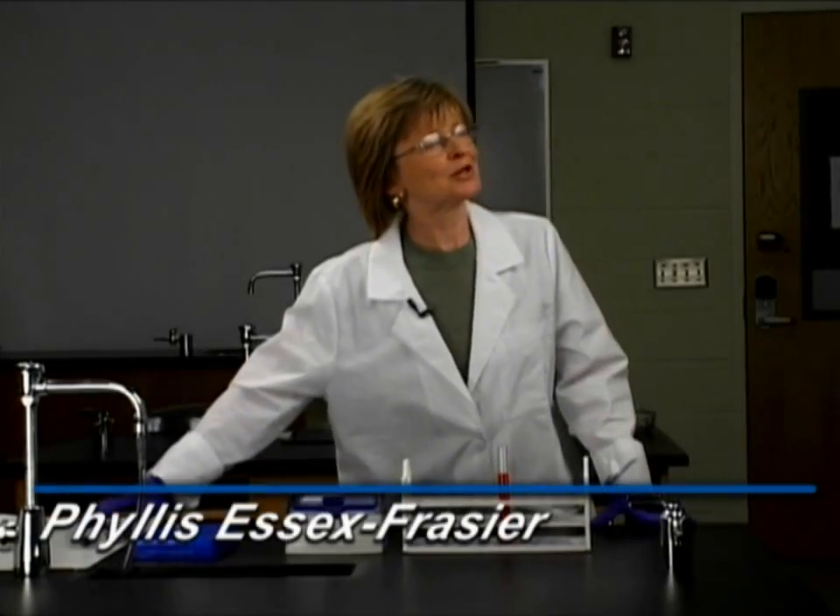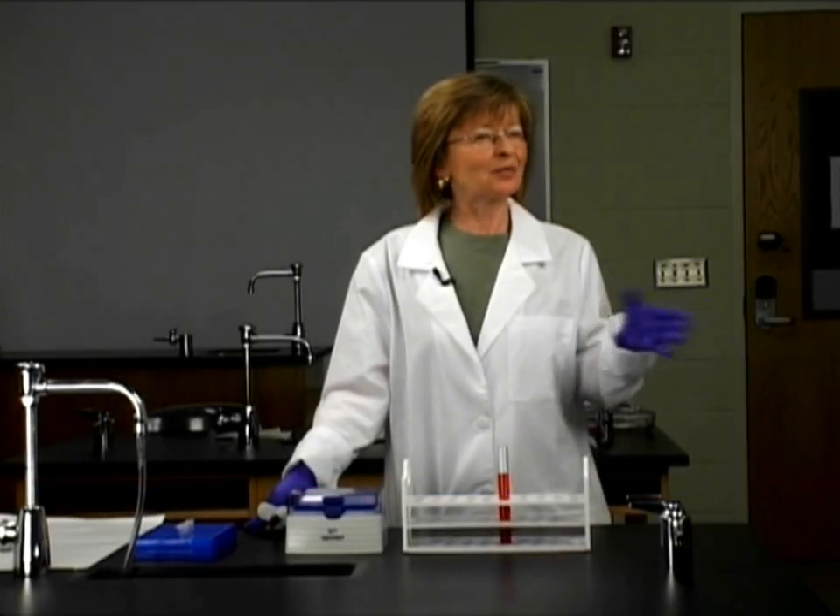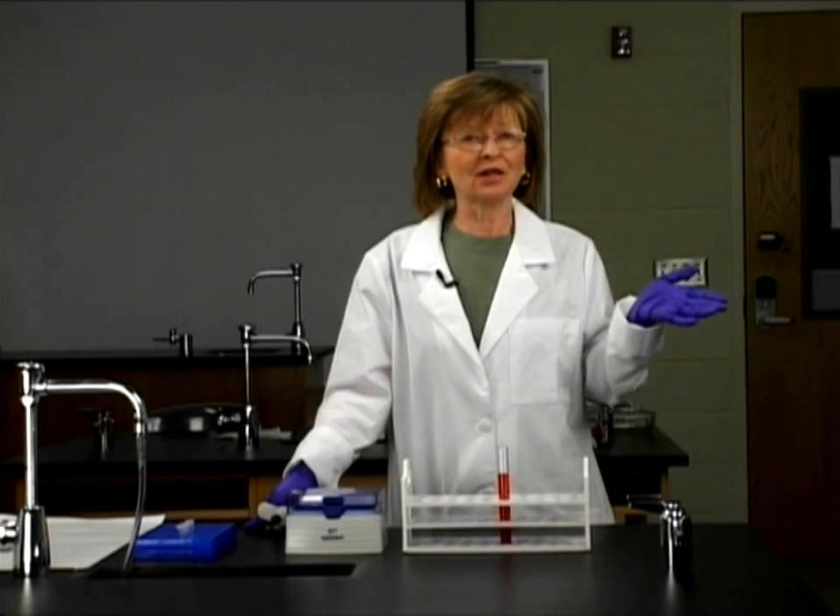Welcome, everybody. Today we're going to be talking about micropipetting. You're going to learn how to use a micropipet — what it is — and then we're going to go through a little demo of how to do that.